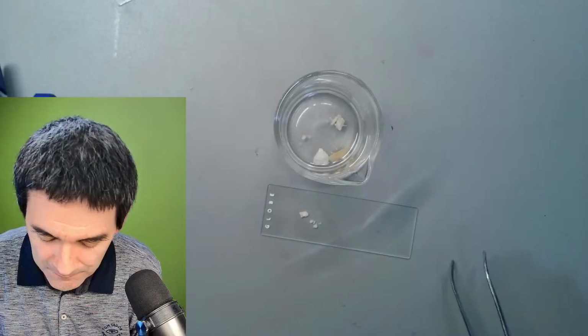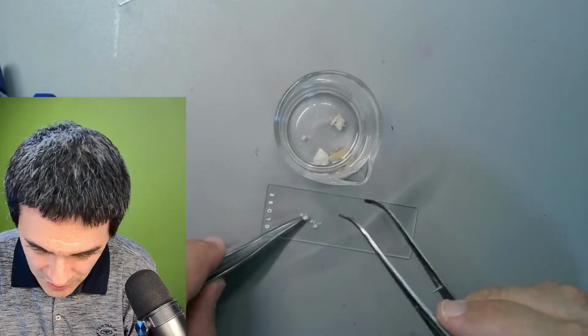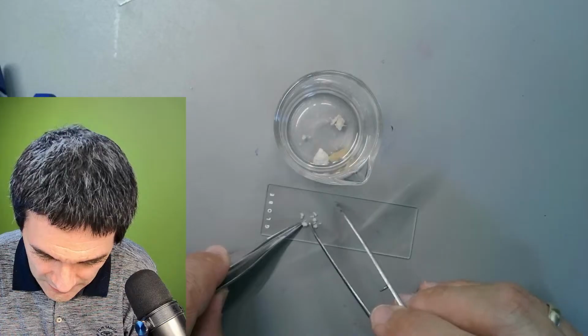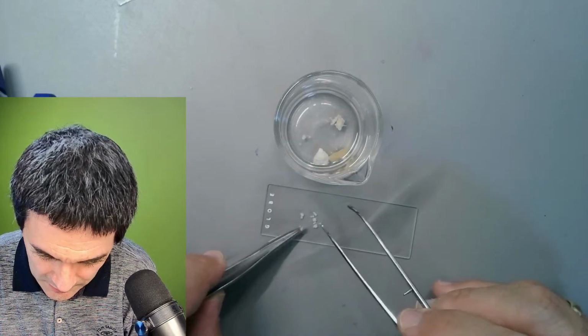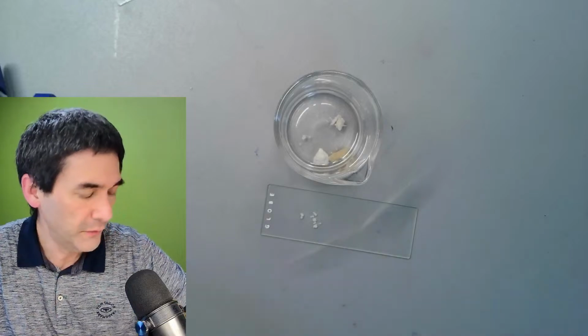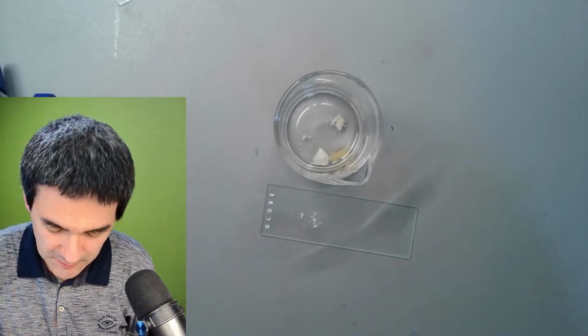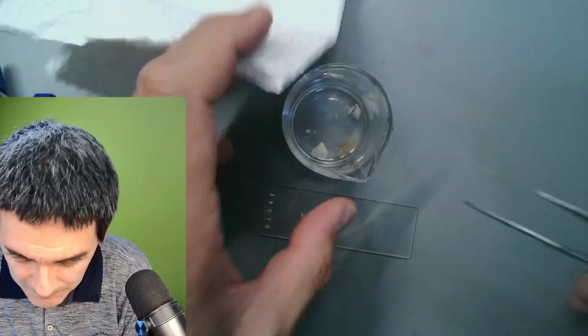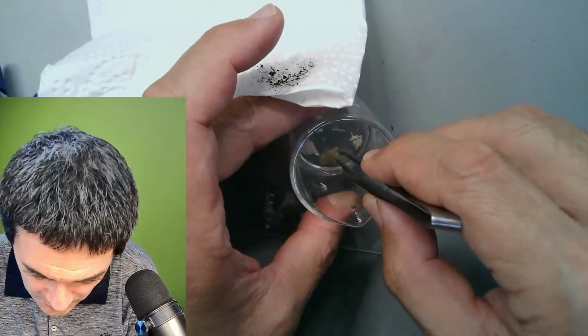So I'm going to just put this away. You have to really rip it apart a little bit. Okay, I'm going to use tissue paper to clean off the tweezers. Okay, this still might be a little bit too thick. So then another one over here.